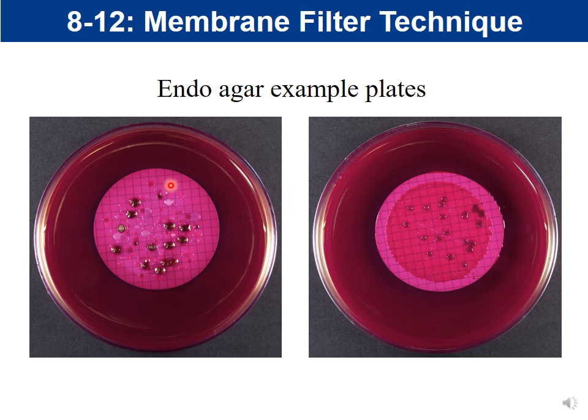So again, they do have disposable one-time use type setups for membrane filtration, but our setup doesn't do that. We use the same setup over and over with new nitrocellulose, but you could get carryover from one water sample to another.